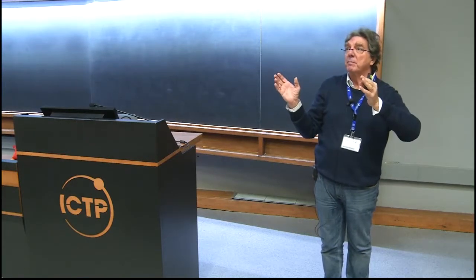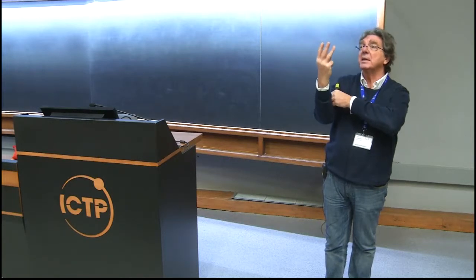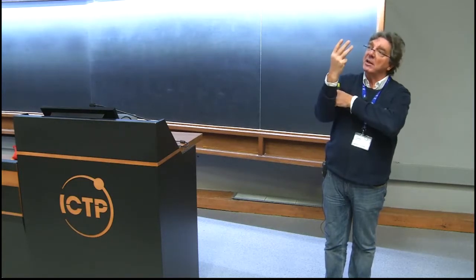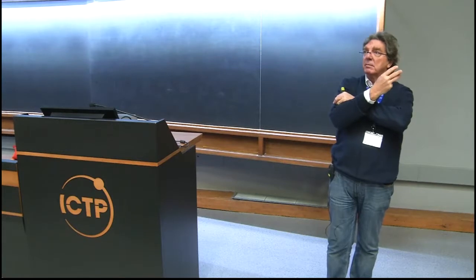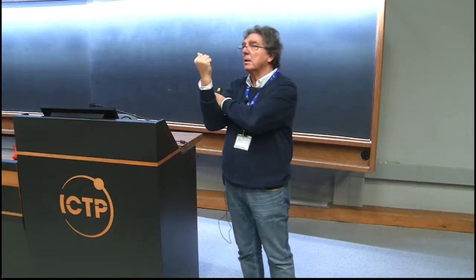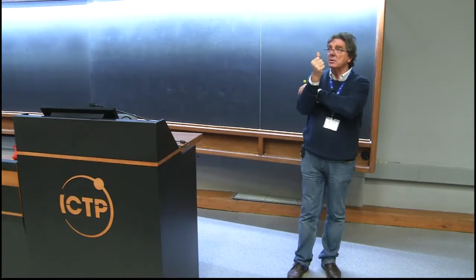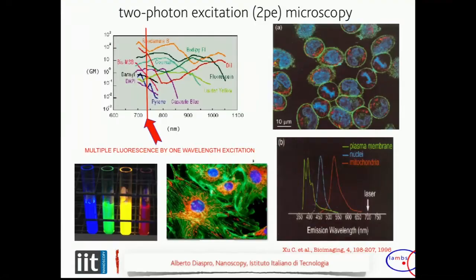And you need three illumination sources that are fluctuating in a different way and that are delivering different energies. But now when you move to two-photon, you can use one illumination source for priming fluorescence in different fluorescent molecules. And then you collect your signal.